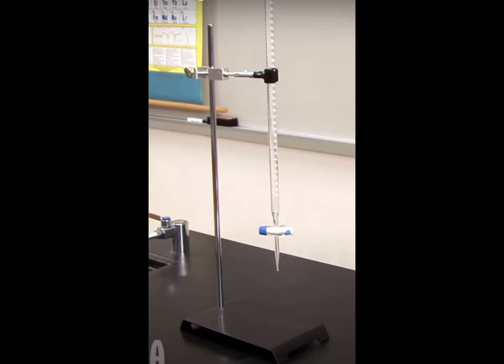It has a valve at the bottom. That's what the white and blue thing is down there. And it dispenses liquid in a thin stream. And it very accurately measures for you how much you've dispensed. It's calibrated just like a graduated cylinder would be. It has lines on it, and you can read the volume from there. So you can read and find out how much liquid I dispensed when you've reached the neutralization point.